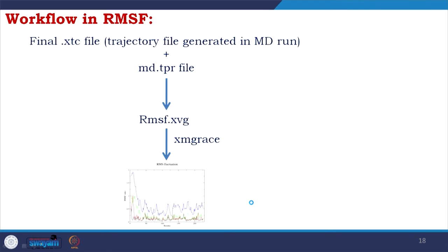For the RMSF workflow: you have the .xtc file and the .tpr file, apply gmx rmsf, get rmsf.xvg, then apply xmgrace and see the graph — RMSF with respect to residue number. You will see individual residues and their fluctuation in different structures.